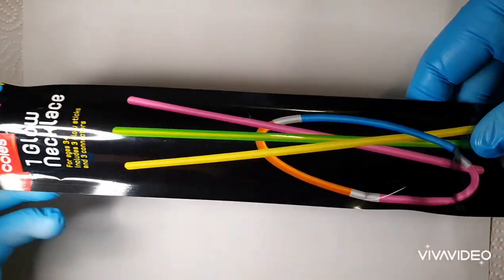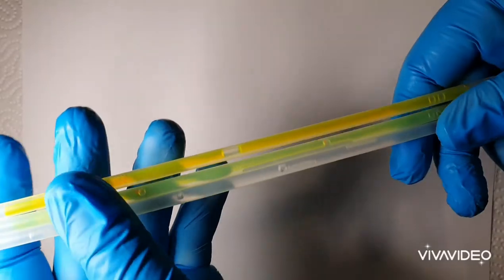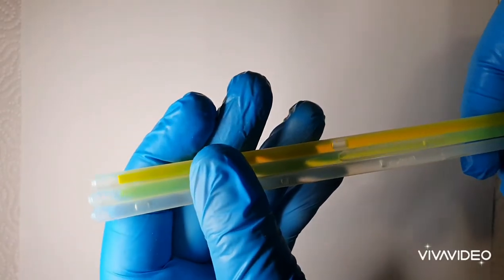Let's have a look at some of the science behind a glow stick. A glow stick relies on a chemical reaction.